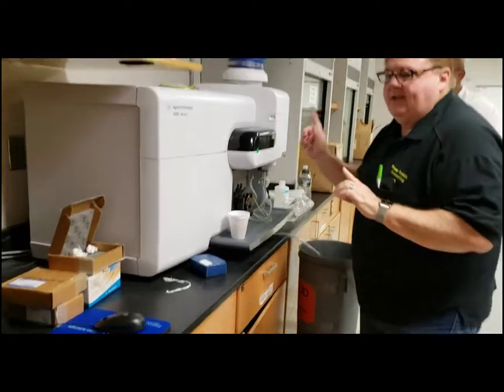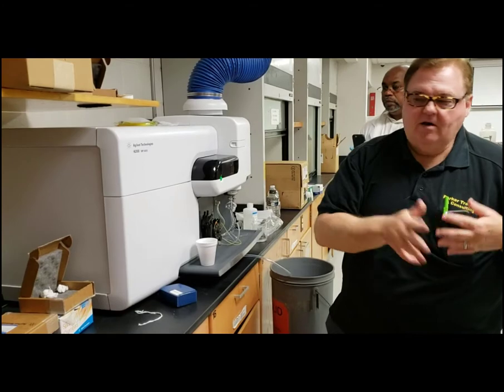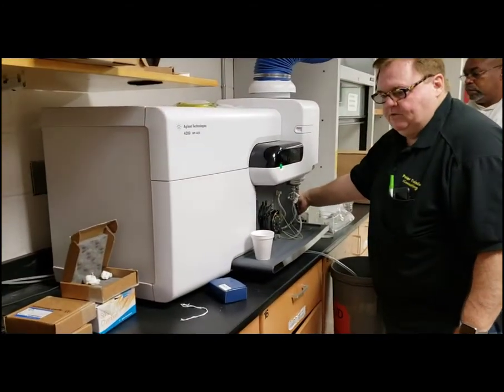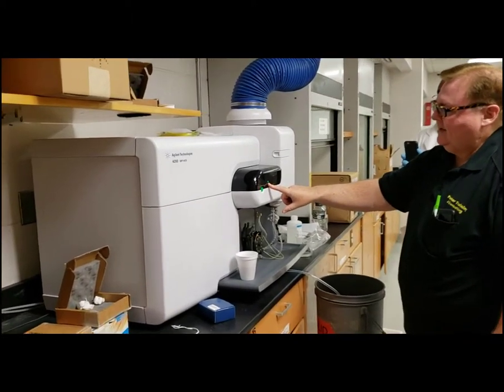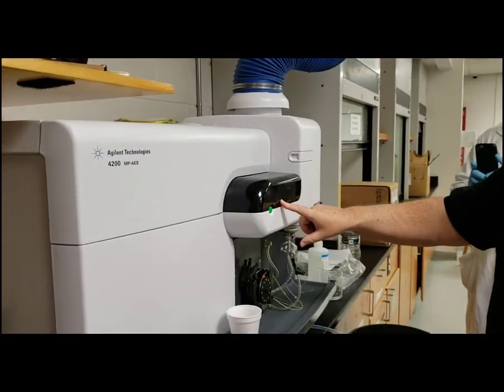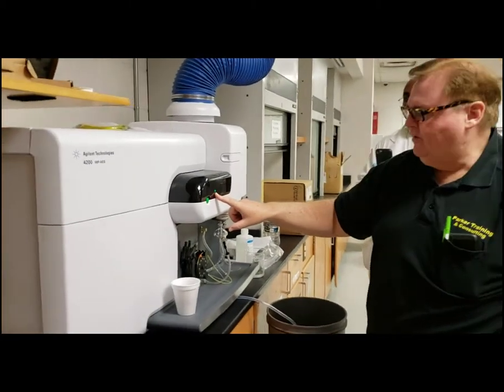Because the instrument sends a signal to the computer and handshakes to the software. Never turn that on first. Turn this on first. The switch is right here on the side. Okay. Now, this is the green light that it's going to be flashing until we turn the computer. This flashing green light means it hasn't established communication to the computer.